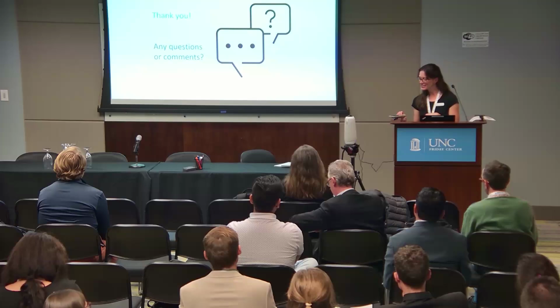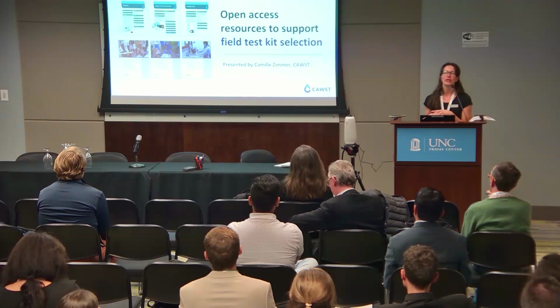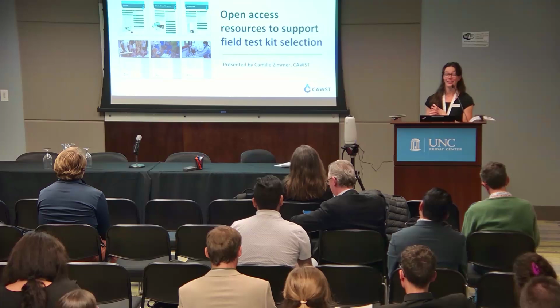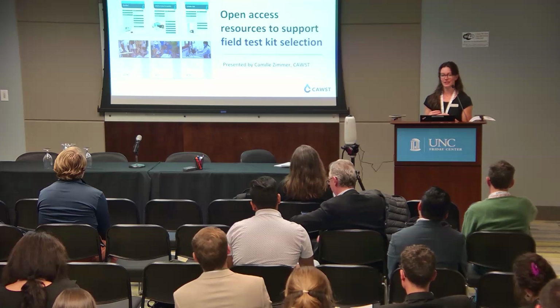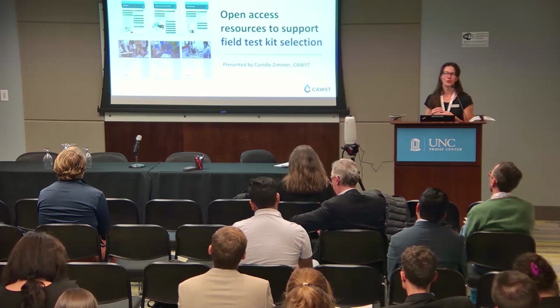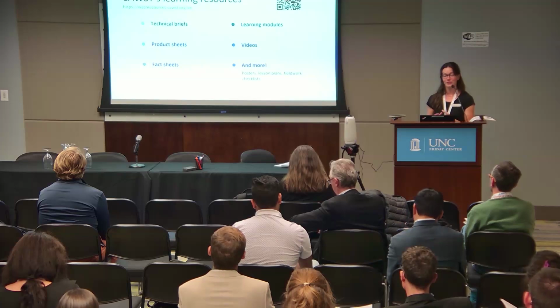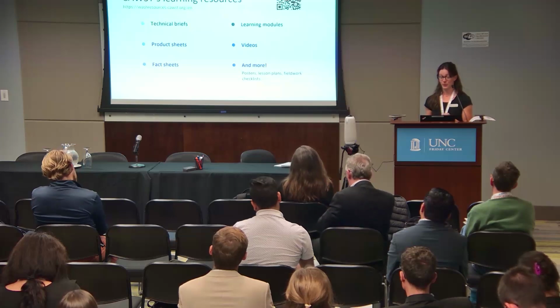Yeah, so with the last couple minutes here, what I would like to do is point our group towards the open access resources that CAWST has online to complement this field test equipment selection guide. So the selection guide doesn't go into super in-depth on each test method, because one of the reasons for this is that CAWST does have a big library on each of these parameters to test for them.